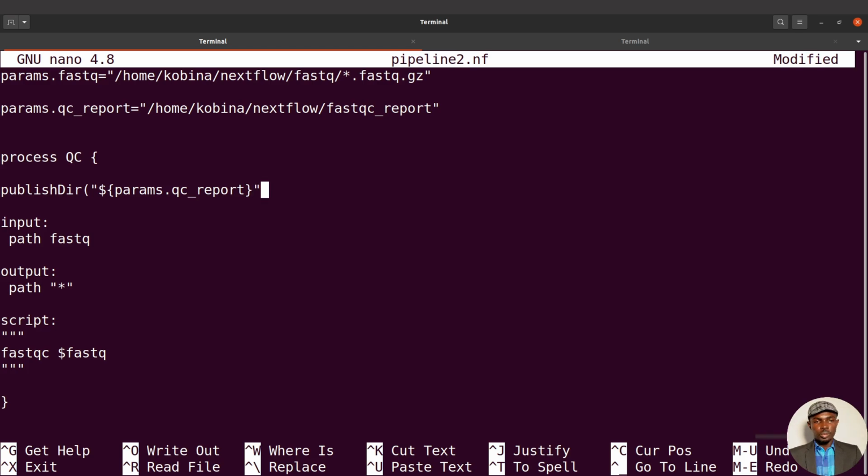You close it, you bring your double quotes. This one works, so I always prefer to use this one. And then I'll bring a comma, and then I'll say mode. I bring a colon, space, I bring a quote, and I'll say copy. And I'll close the brackets.